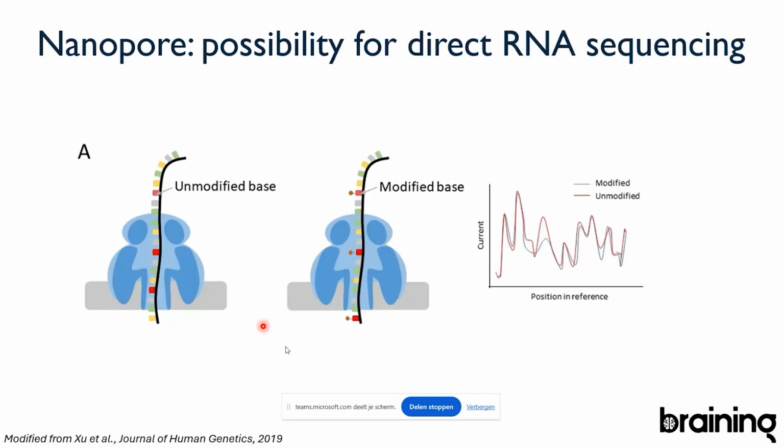And that is exactly the principle that you can use to look at RNA modifications using nanopore, right? So what you would see here is an electrical current pattern for an unmodified base in red, right? And you can see where the bases are modified. For example, here in the blue line, there is a difference between the blue and the red, which means that this base is going to be modified.